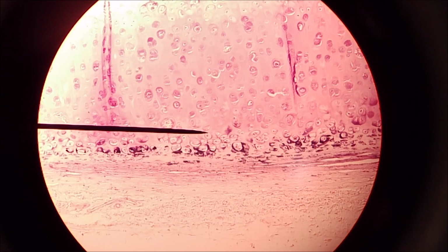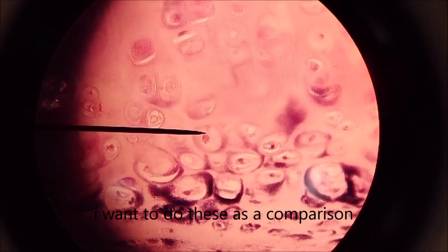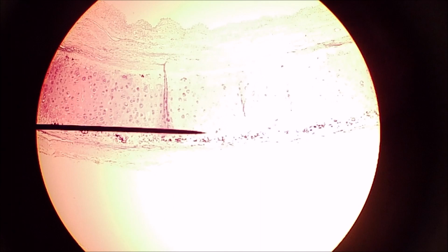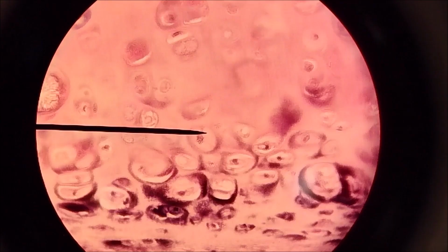This is hyaline cartilage. I can zoom this in a little further. All right, those are chondrocytes in lacunae. You can see this very smooth appearance. All right, this is classic hyaline cartilage, in this particular case coming from the trachea. Nice, clean hyaline cartilage.